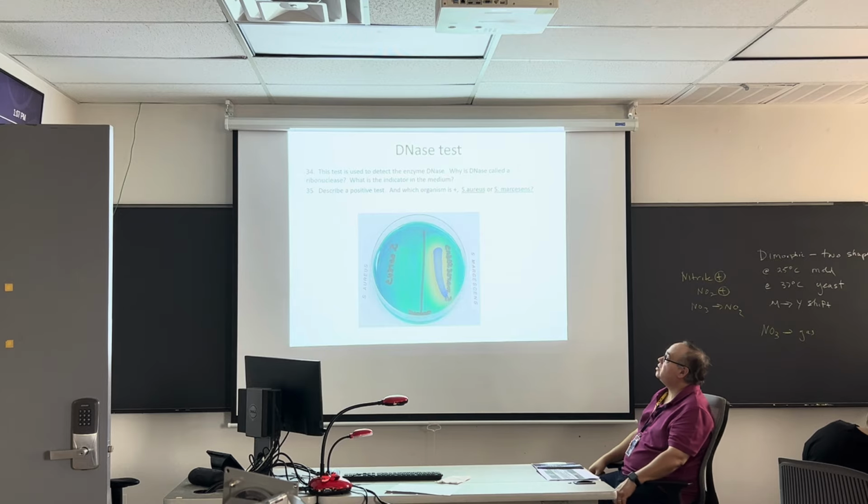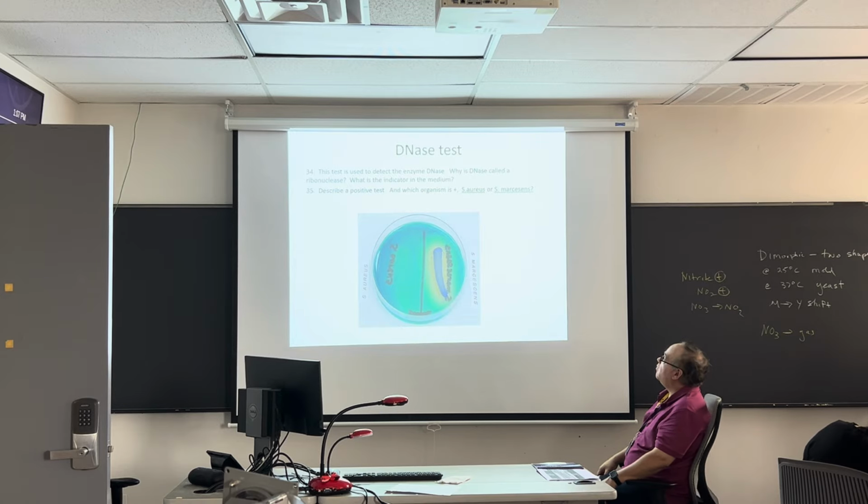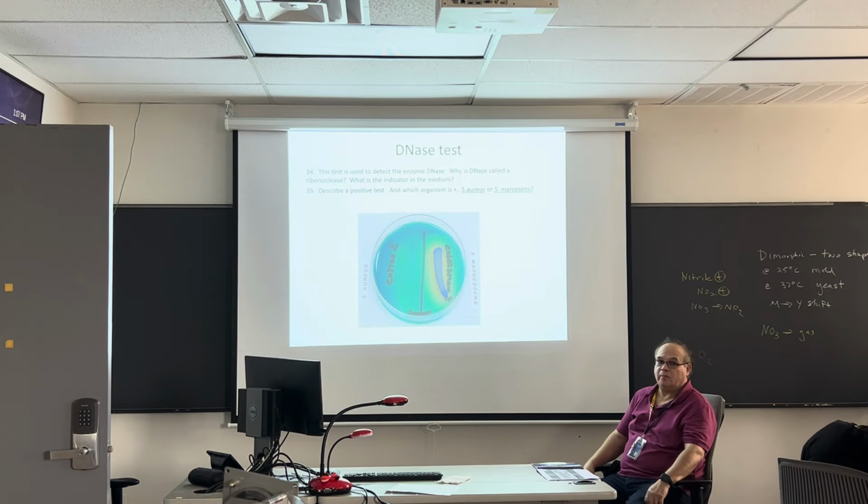So this is the DNase test. Okay? Why is DNase called a ribonuclease?